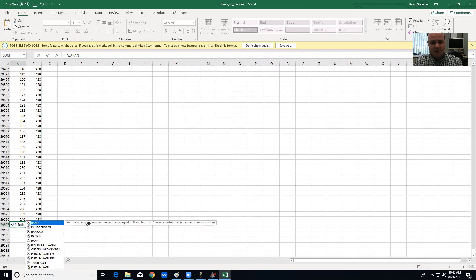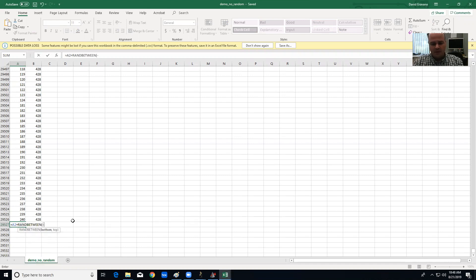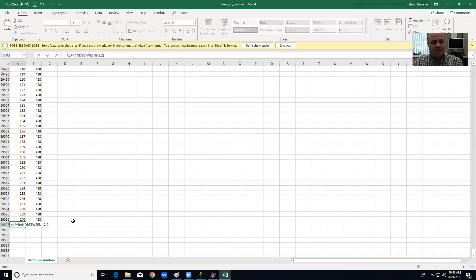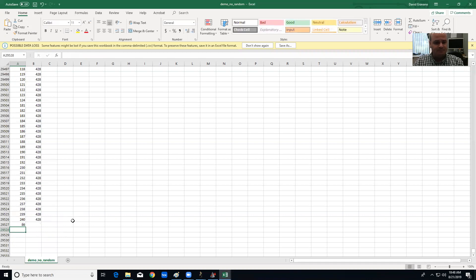And then I'm going to put this formula called RANDBETWEEN and what that's going to do, I'm going to do minus 2 comma 2. What that's going to do is it's going to generate a random integer between negative 2 and 2, and what I'm doing here is adding it to cell A2.